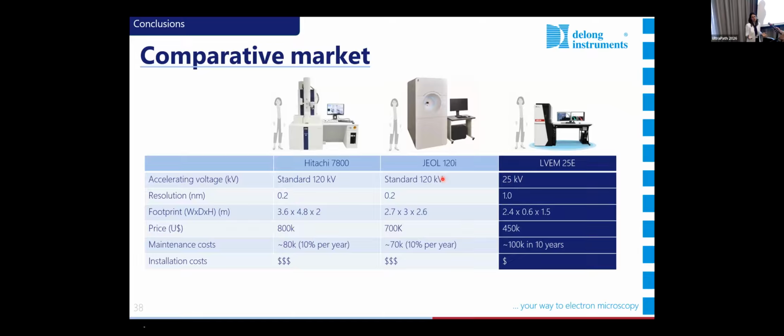resolution. When we are talking about the standard conventional TEM, 0.2 nanometers, 0.1 nanometers. If we are in material science, for example, that's a big limitation. They need to see atomic level resolution, right? Or some very small proteins you are not able to see at low voltage. Everything above 5 nanometers, you have a very good picture. If you are near 1 nanometer, it's too close to my limitation. So you may be able to see, but not as clearly as you were expecting. But that's the main advantage, the resolution is the main advantage. Yeah, disadvantage.